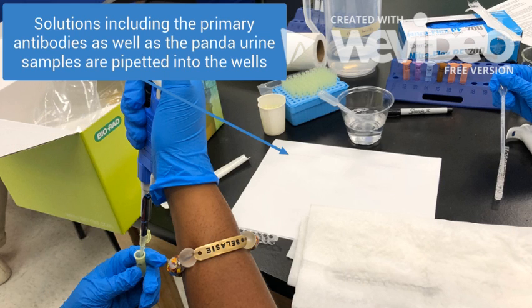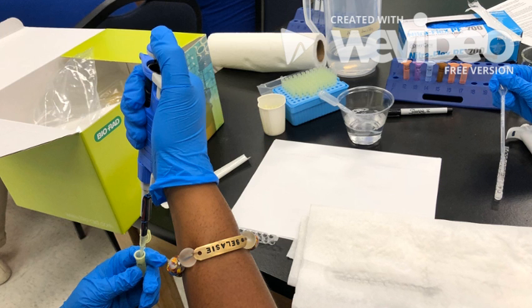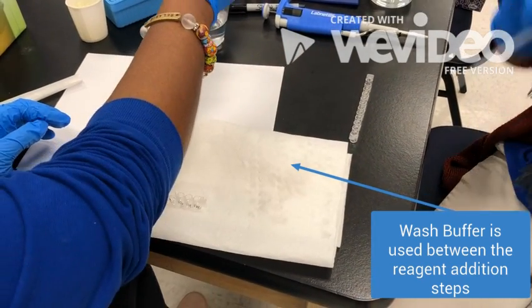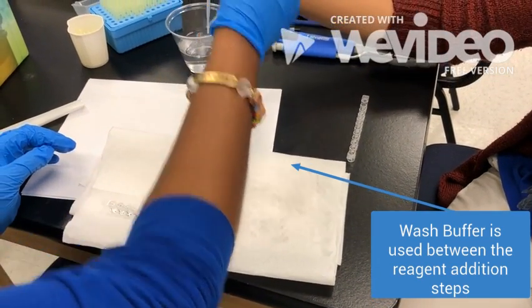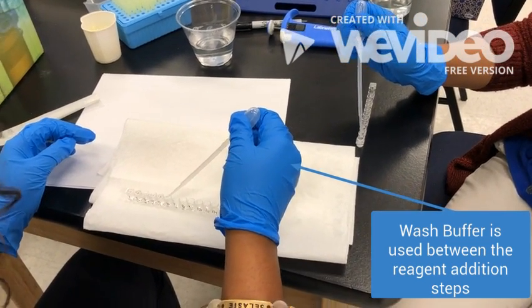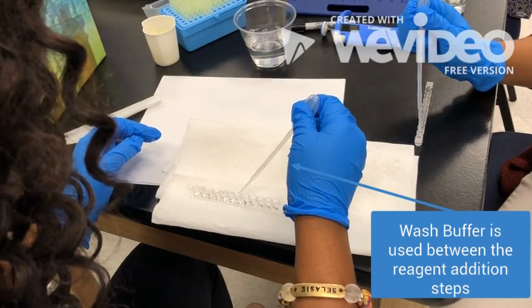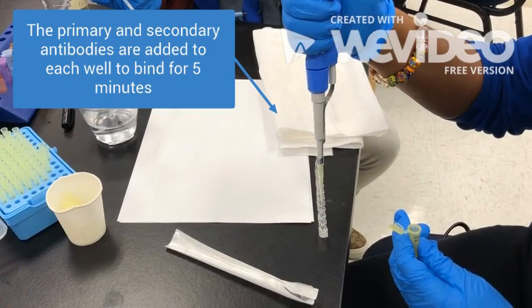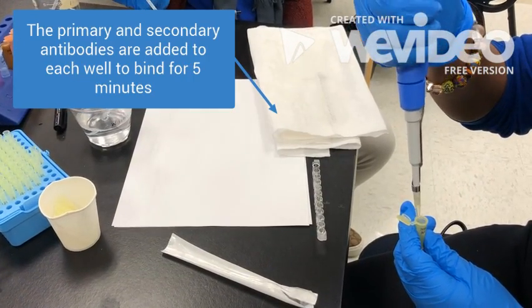Using the second well strip, 50 microliters of the positive and negative control is transferred into the next 6 wells labeled positive and negative. Similarly, 50 microliters of the panda A urine sample and the panda B urine sample is transferred into the next 6 wells labeled panda A and panda B. Wash buffer is pipetted to the tops of the wells in between the periods of which we added the primary and secondary antibodies, which both rested for 5 minutes for binding purposes.